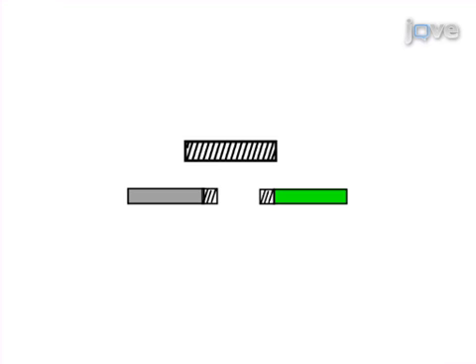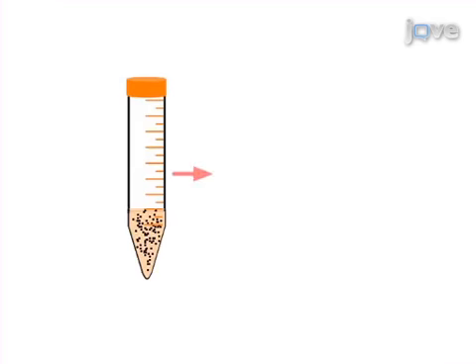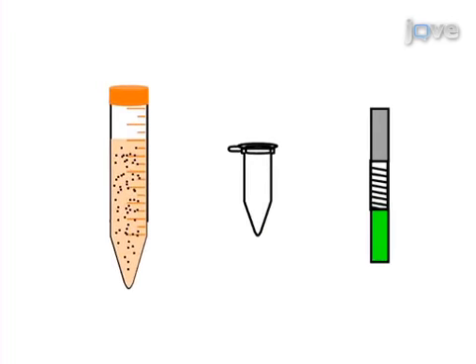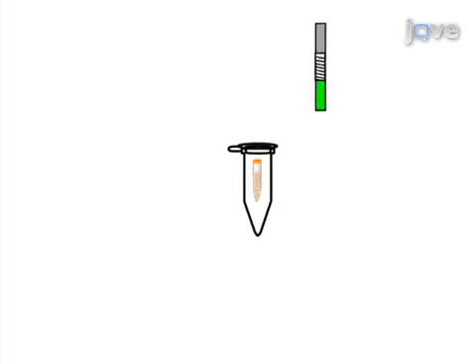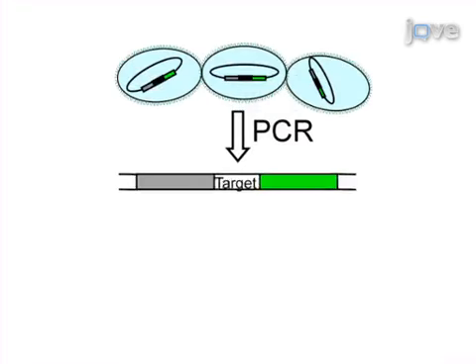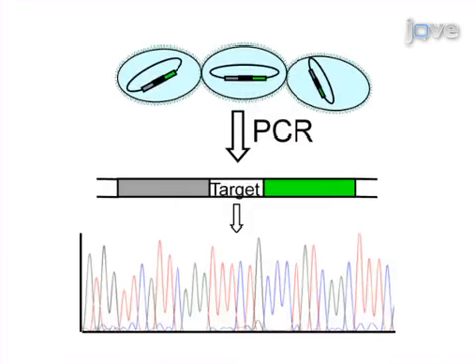The second step is to obtain the linear recombinant PCR amplicon using the 3 PCR amplicons as templates. Next, the competent S. sanguinis cells are prepared. The final step is to transform the linear recombinant PCR amplicon into competent S. sanguinis cells. Ultimately, colony PCR amplification and DNA sequencing are used to verify the correct mutants.